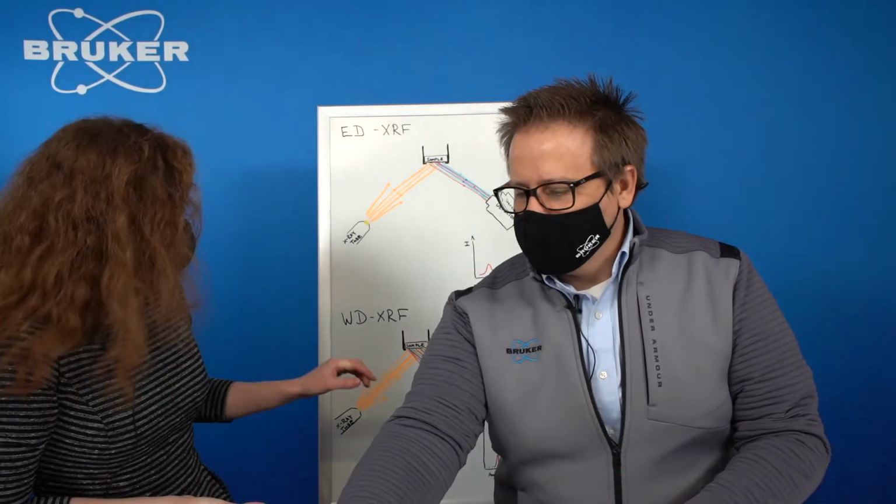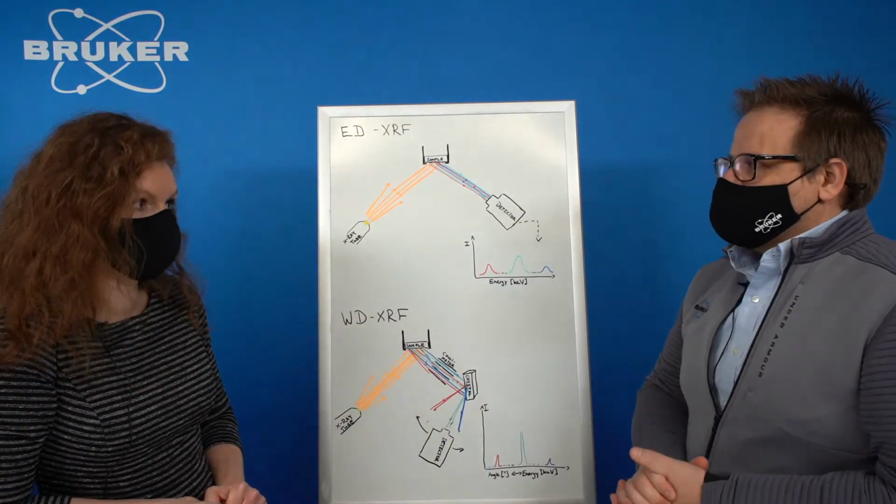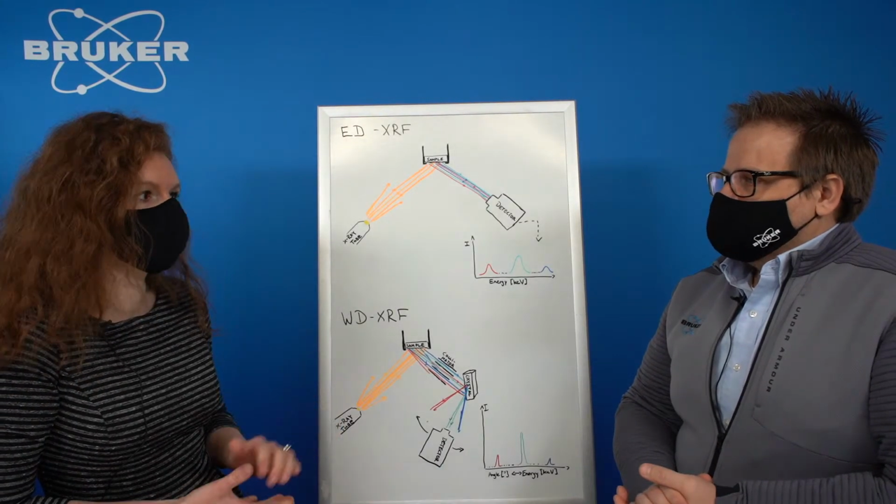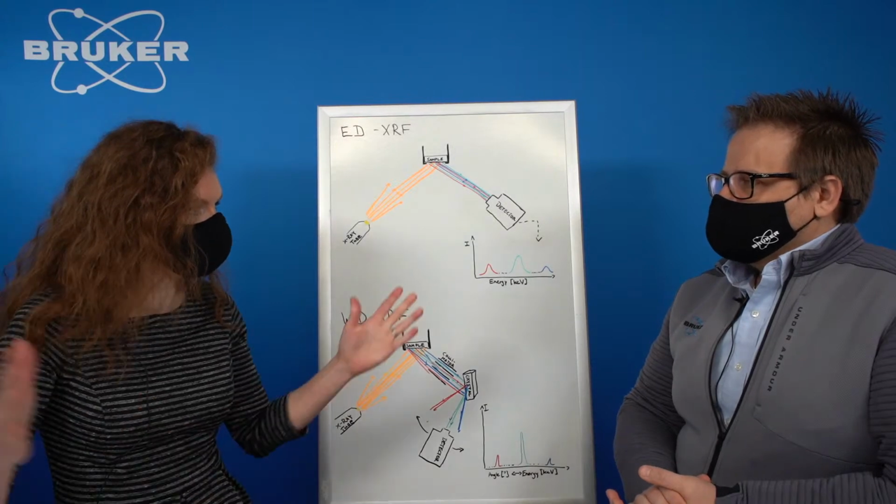No, in the S6 JAGUAR, we have space for 4 crystals. On the S8 Tiger, we actually have space for 8 crystals. But 4 crystals is pretty much all that you need if you want to look at everything.